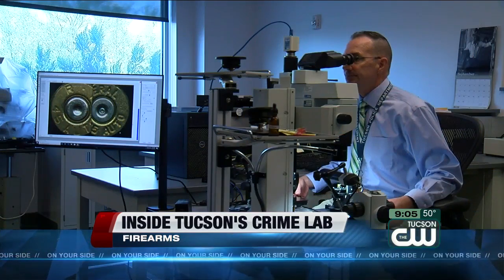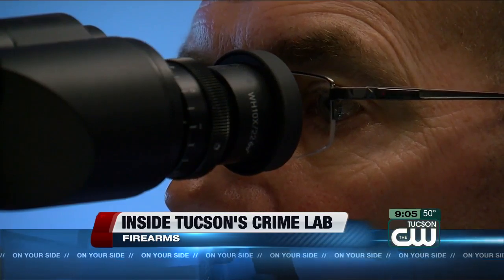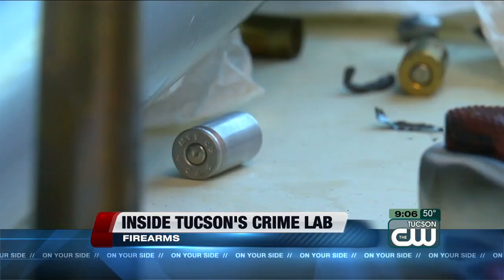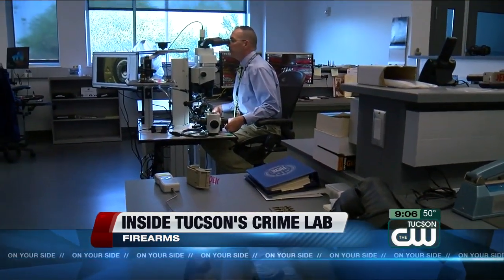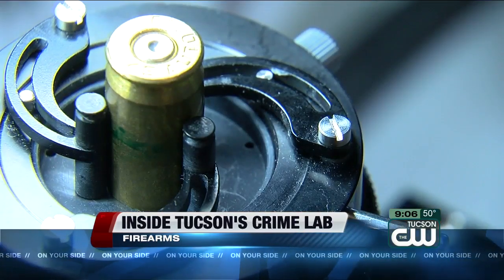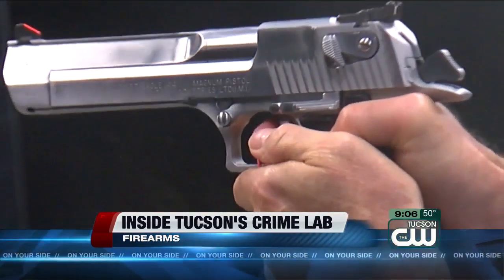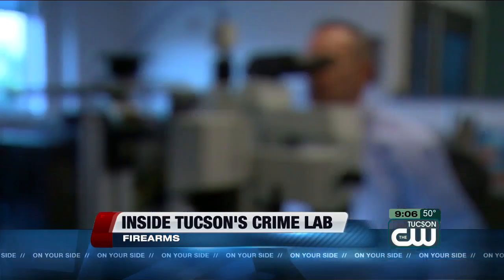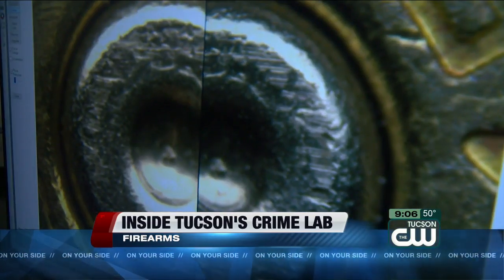Once detectives get moving on a case, they go to firearms examiner Thomas Murphy to see if the gun fits the crime. So I'm going to take that gun and compare it to cartridge cases or other ammunition components that are recovered at a crime scene to identify whether a particular firearm fired those bullets or cartridge cases or didn't fire them. The guns are also tested as short and long range. Long range, we're recovering cartridge cases there to put on a microscope to compare to evidence that may have been recovered at a crime scene.